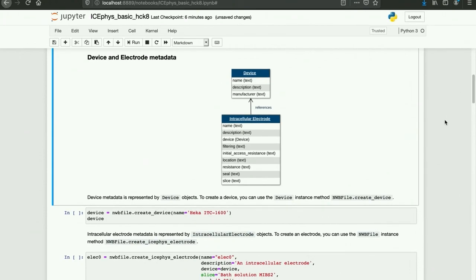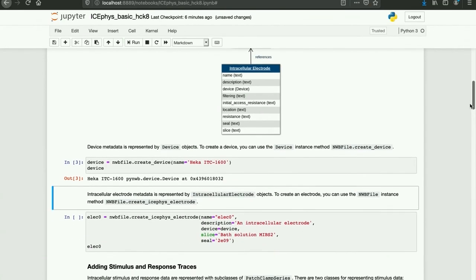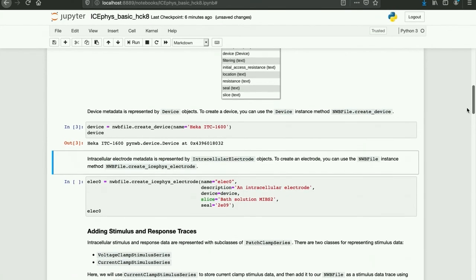Next, we store metadata about the recording devices in a device object. To create a device, you can use the instance method NWBFile.createDevice. Electrode metadata is stored in an intracellular electrode object. To create an electrode for intracellular recordings, we use the NWBFile instance method NWBFile.createIcephysElectrode. We include a reference to our device object here, along with additional metadata about the seal resistance and the slice preparation.